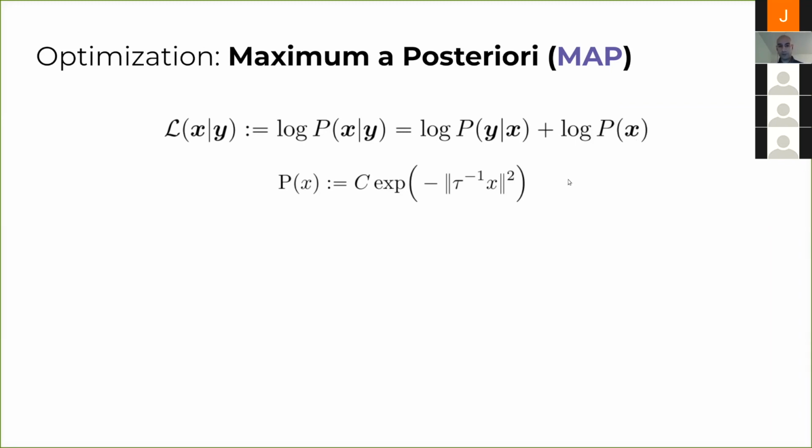I won't mention what this term looks like because it's really not relevant in this case, but it's basically just a comparison between the projections of the model and the data. Whereas this term usually is assigned something like this, an exponential prior probability.